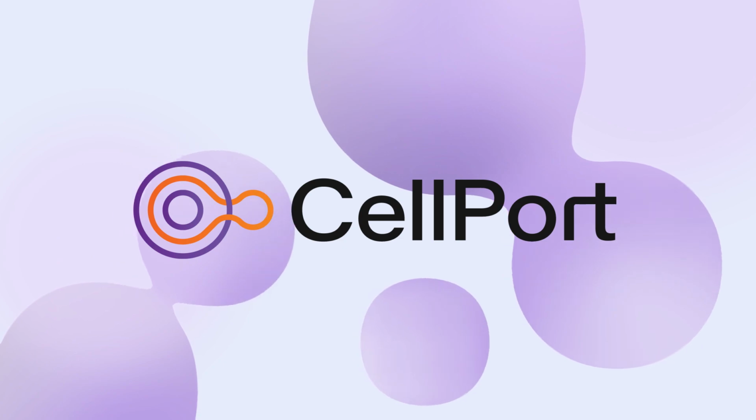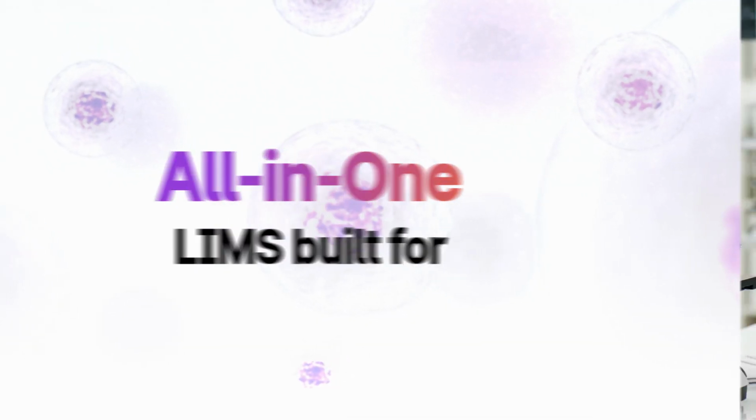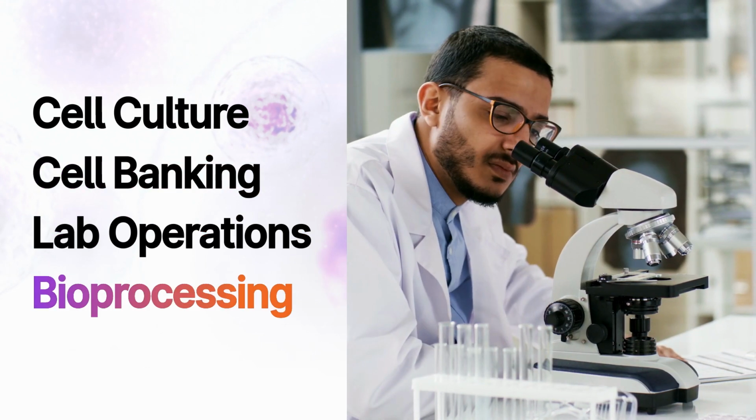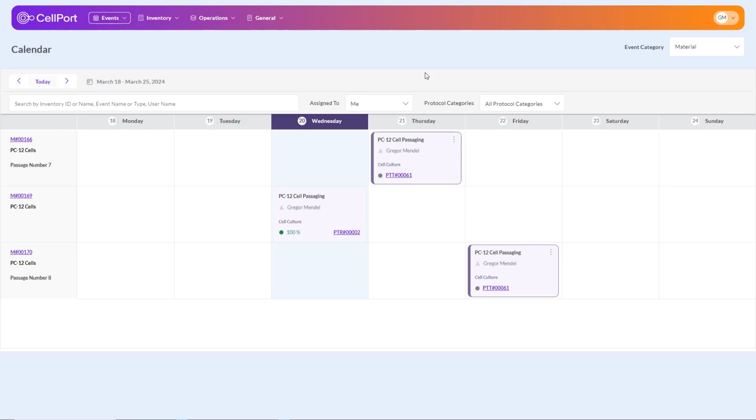CellPort is the world's first all-in-one LIMS built for cell culture, cell banking, lab operations and bioprocessing. In this video, get a brief demo of CellPort.